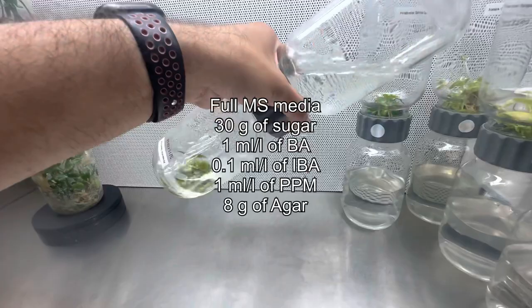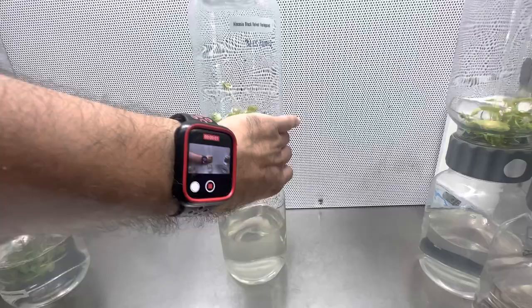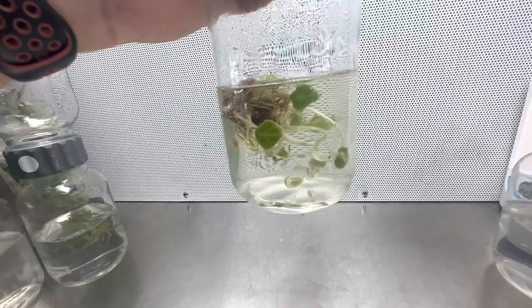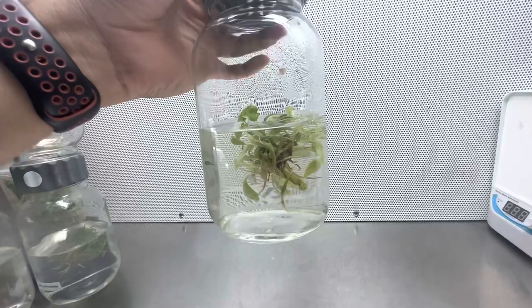So, this is the entire list: Full MS media, 30 grams of sugar, 1 ml per liter of BA, 0.1 ml per liter of IBA, 1 ml per liter of PPM. If you are using solid media, I use 3 grams of Gellan Gum or 8 grams of Agar. If you are using liquid media like I have in the biocouplers, I do not add any gelling agent.